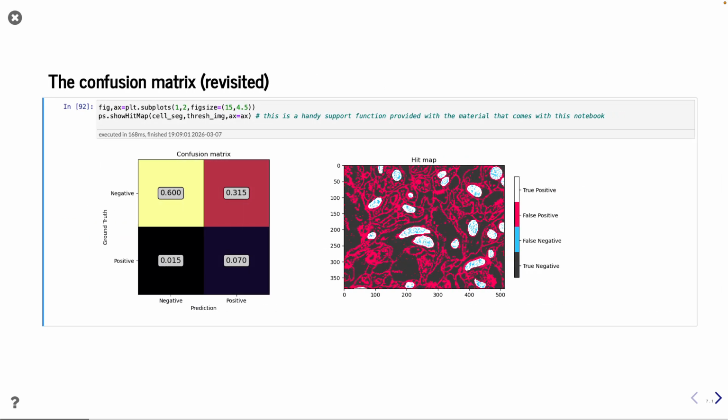This can be a bit formalized into something called a confusion matrix. We already had it in lecture 2, and now we're going to use it in more detail. So here we can put some percentages for the different parts. A different way to visualize it is to combine all the four images I had in the previous one into a single one and color code the values depending on what it is.